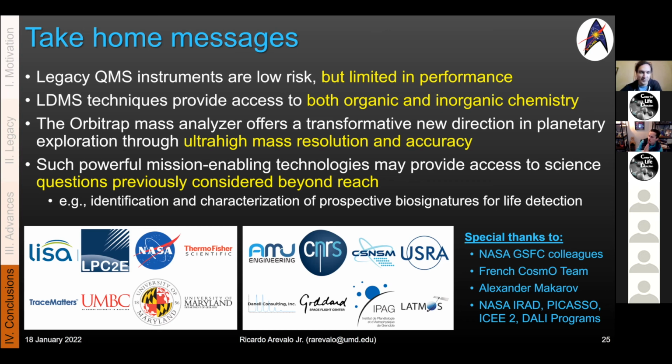Yeah, so first one is mass range. It is tunable, absolutely. So when we were getting ready to respond to the Europa lander mission, when it was a mission, we had envisioned carrying multiple experiments. One trying to look at the inorganic stuff, which would be lower mass, and one trying to focus in on the higher mass stuff. And so the SDT, for example, wanted relative abundances of amino acids with respect to glycine, which is 75, right?